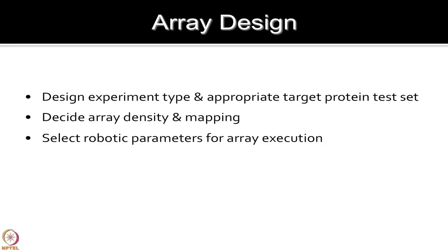Once you do that, you are also looking at the chemistry selection, which type of slide you are going to use, nitrocellulose, glass, gold, which type of array you are going to make, and of course, the strategies for DNA purification. All these contents are mixed into the master mix, the printing buffer, and then you are ready to do the printing. So, array design, as I mentioned, is the most crucial part, and that is where it takes most of the time before any experiment actually starts.